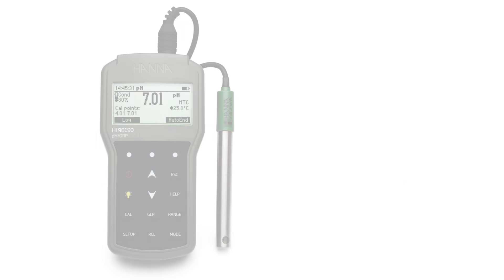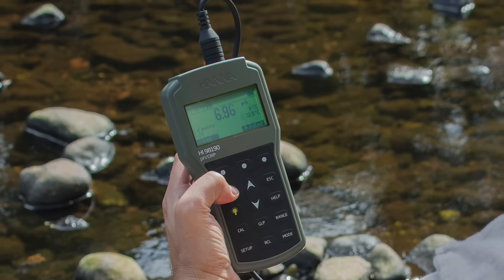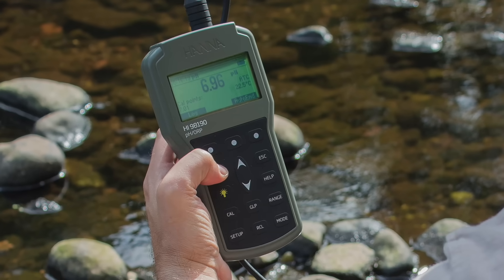The HI-98190 and HI-98191 are part of Hanna Instruments' newest line of portable meters for the measurement of pH, ORP, temperature, and selective ions. These ergonomically designed waterproof meters are constructed to withstand the harshest of environments while maintaining benchtop-level performance.